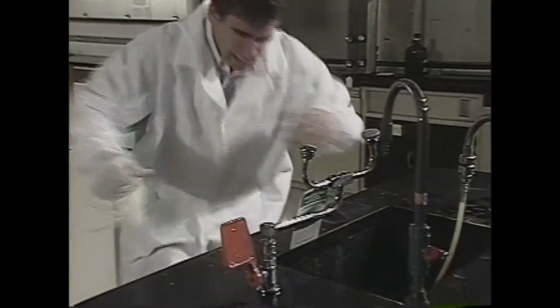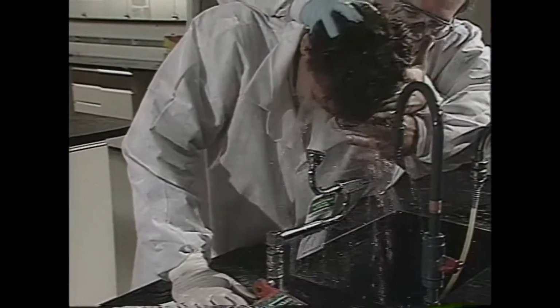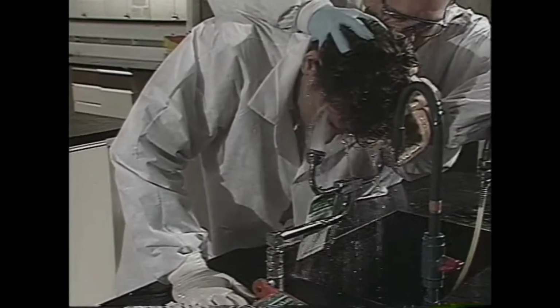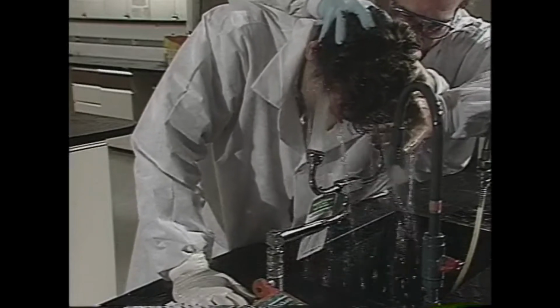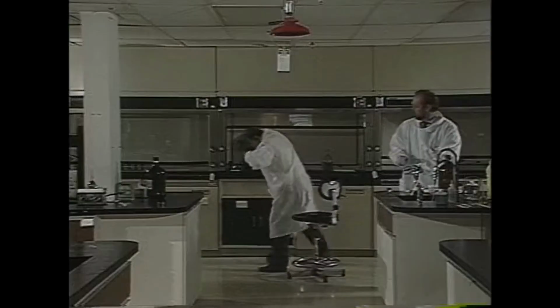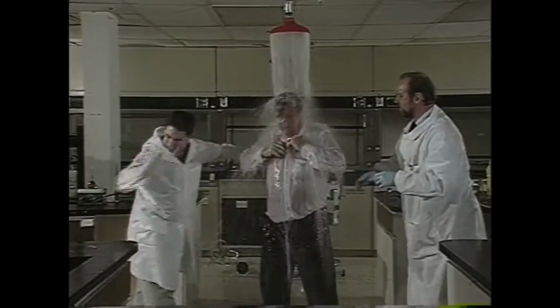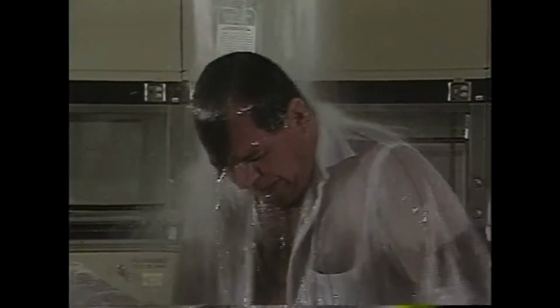If a chemical splashes into your eyes, get to an eye wash as quickly as possible. Hold your eyes open and in the stream of water for at least 15 minutes. This may feel uncomfortable, but your eyesight could be at stake. If a chemical splashes onto your body, call out for help and head for the nearest safety shower. You'll have to remove your PPE and your clothing. The shower water may be cold, but remember, a corrosive chemical can cause permanent damage. You need to stay in the shower for at least 15 minutes, rinsing the affected areas thoroughly.